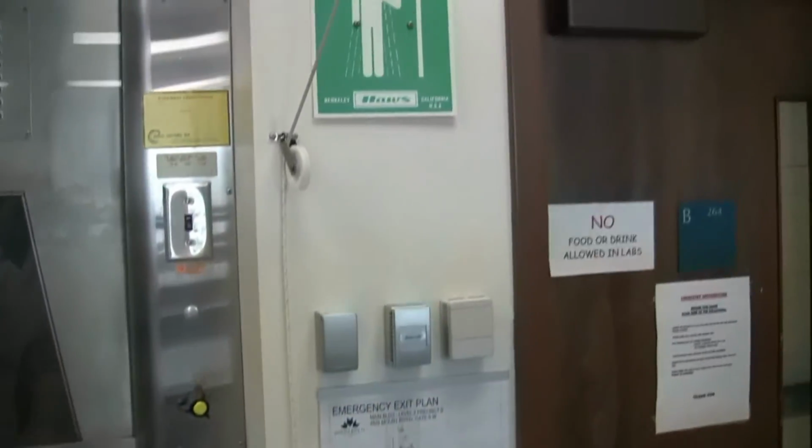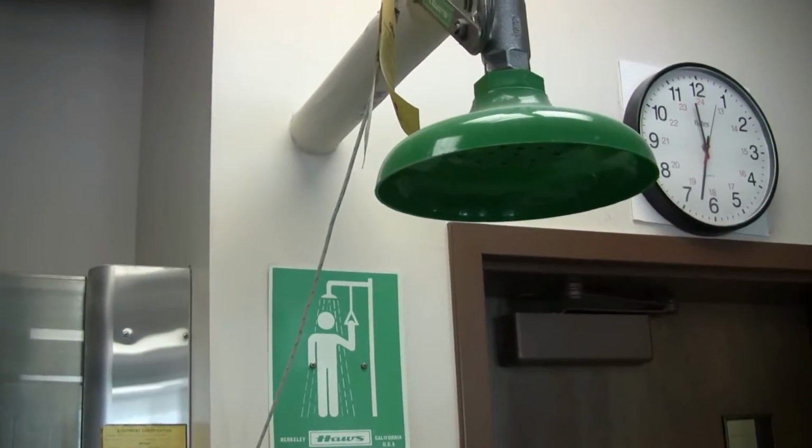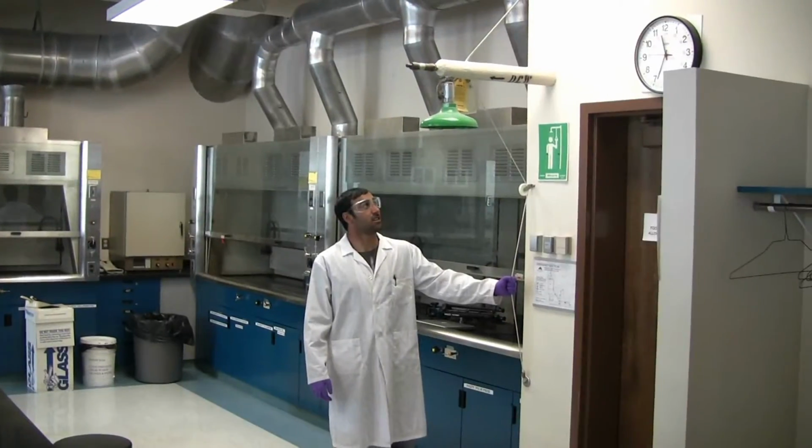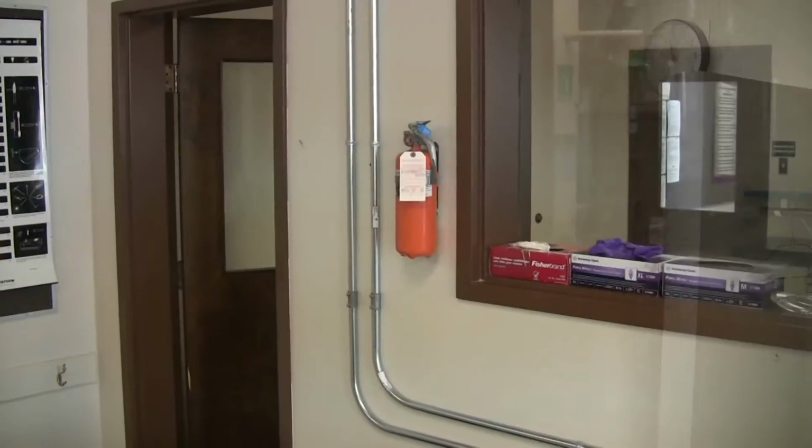Right next to the door is the chemical shower. Pull it if you are on fire or spilled chemicals on your entire body. Along the wall is a fire extinguisher, sets of gloves.